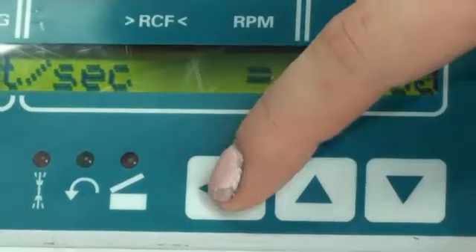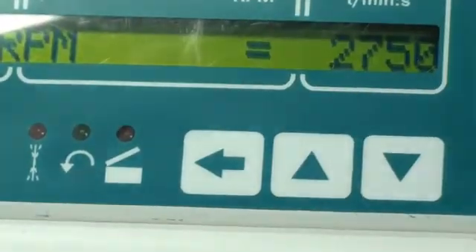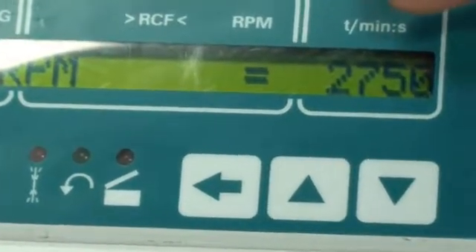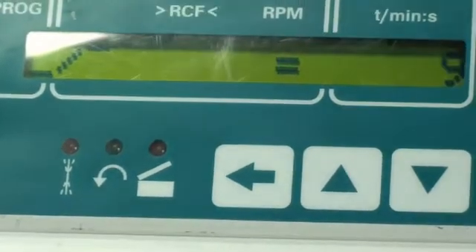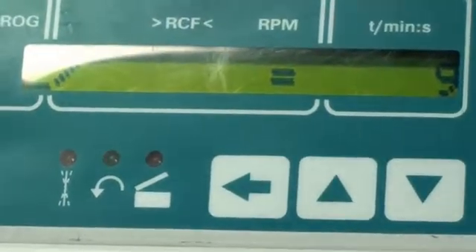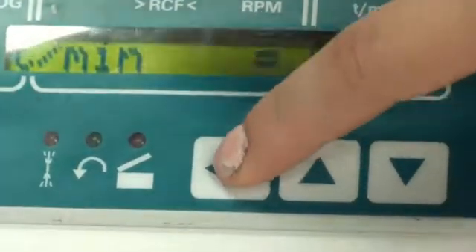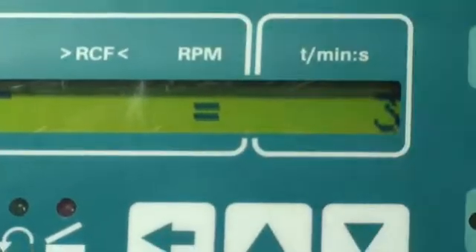I'll do 1 minute 30 seconds. You can also choose RPM — rotations per minute. So right now we have 2750. You can also decide the incline, so at the beginning of your rotation, if you want it to speed up very fast or if you want it to be a little bit slower. I'll put it at 3.